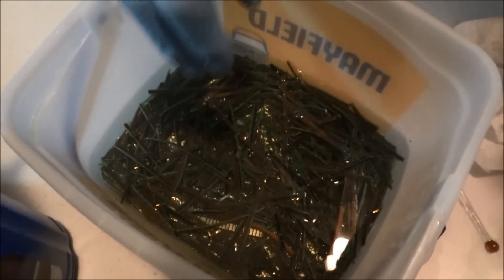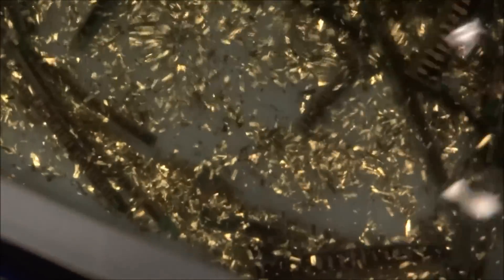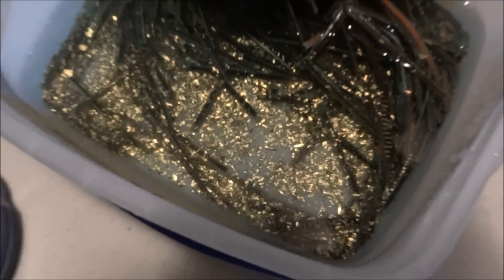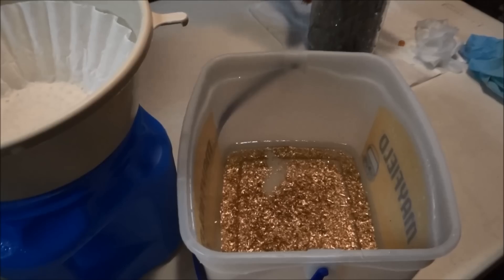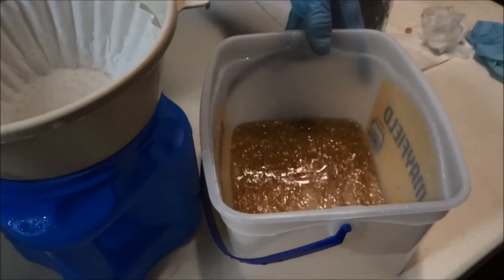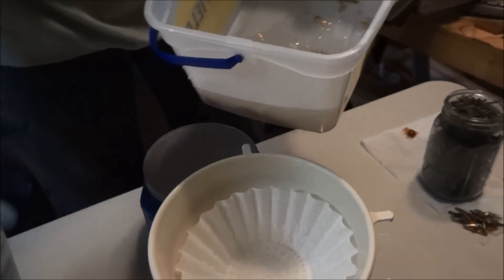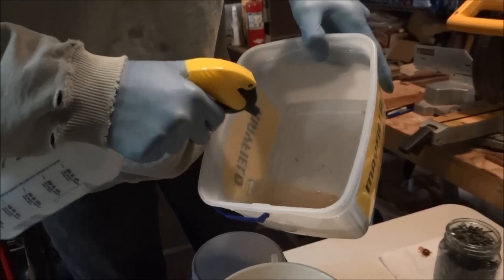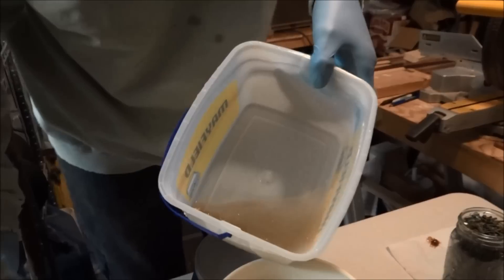Just picking out my fingers right here — see all that gold down in there! I've picked all the fingers out and now I'm left with gold water. Going to filter this, dumping it through a coffee filter. I kept adding distilled water — putting it in a little spray bottle helps move those little tiny pieces around.